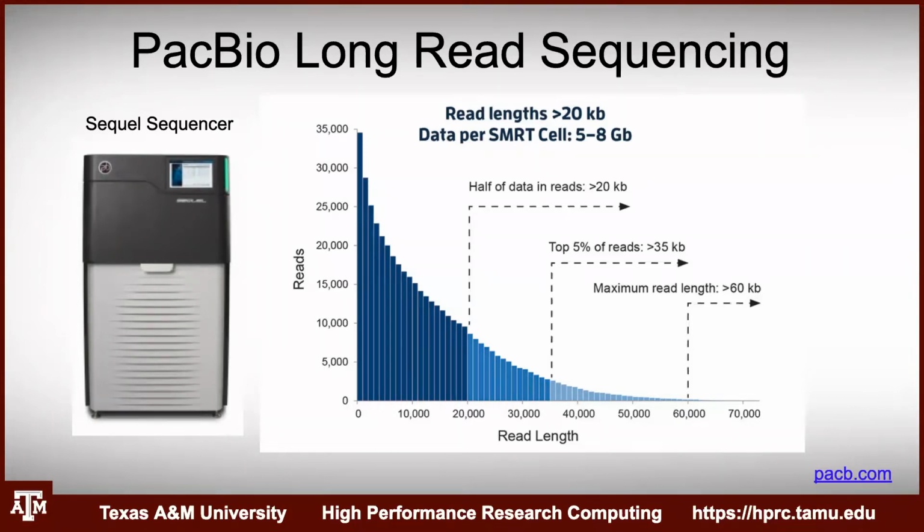Now, a lot of people are moving towards PacBio-only assemblies, and they're getting full chromosome length assemblies quite easily. The genomes that we're seeing now, that we're getting relatively inexpensively, are very high quality, much better than even 4 or 5 years ago.